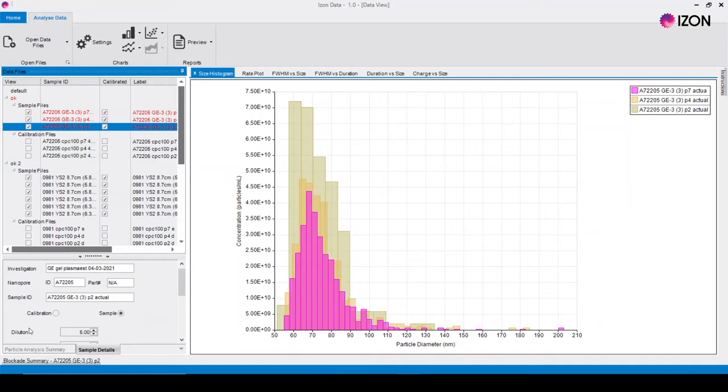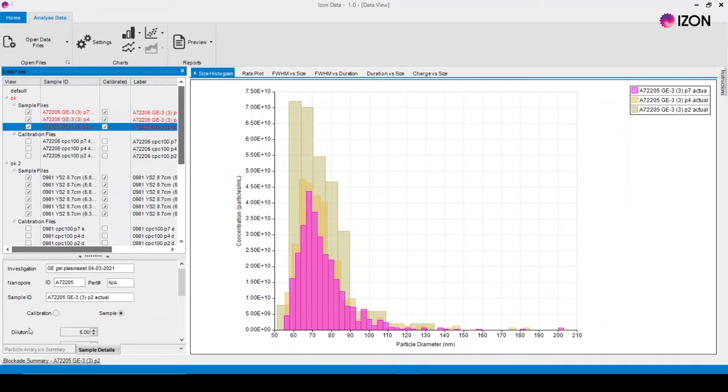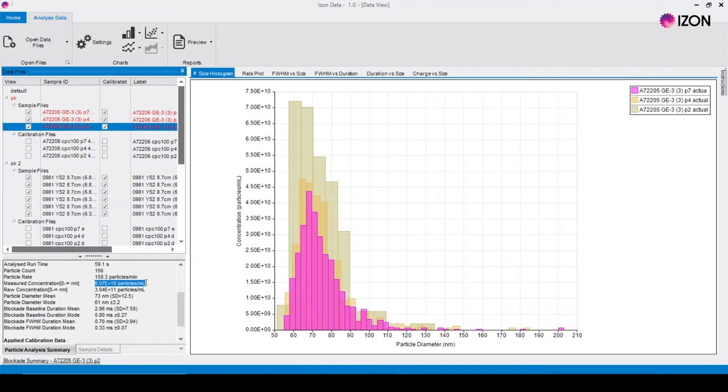On the particle analysis summary tab the mean diameter in nanometers and the concentration of the sample in particles per mil are now displayed. You will see that all values on the x-axis of the size graphs have now been converted from nanoamps to nanometers.